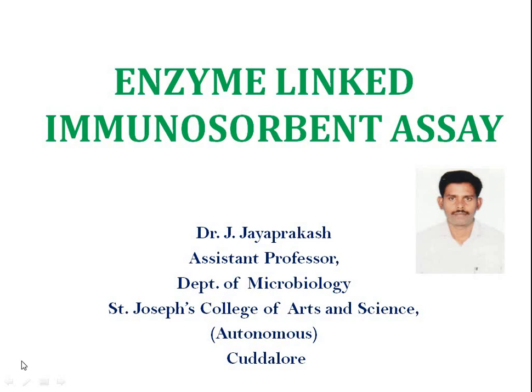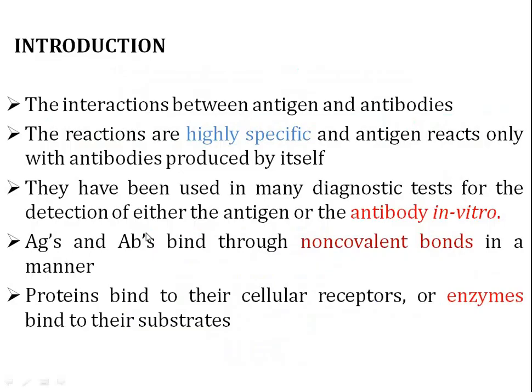Everyone, let me discuss enzyme linked immunosorbent assay. The interaction between antigen and antibodies. The reactions are highly specific, and an antigen reacts only with antibodies produced against it. So antigen antibody interaction means that a specific antigen can bind with a specific antibody.